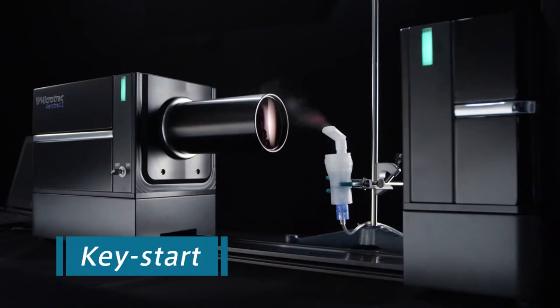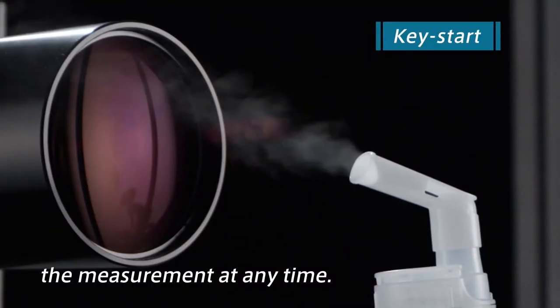Key-start. Measurement is started by using a keyboard or by clicking a mouse. You can start the measurement at any time. This is suitable for evaluation of product performance or quality control.